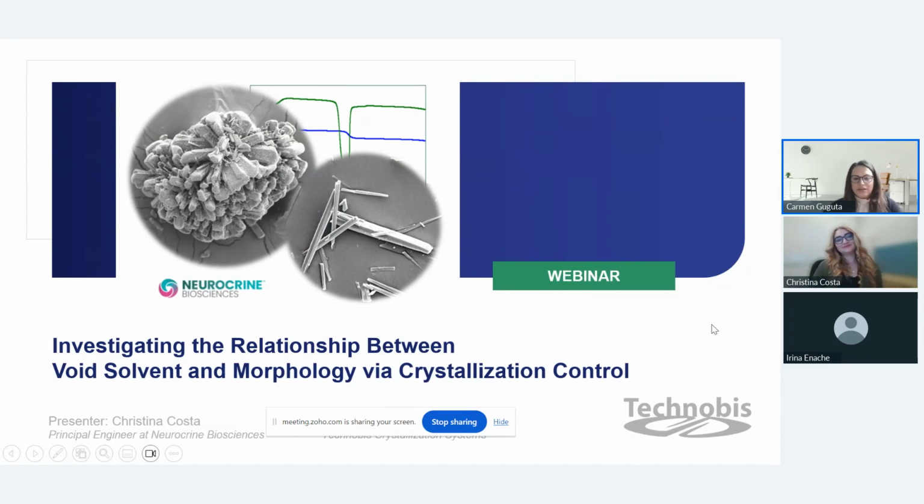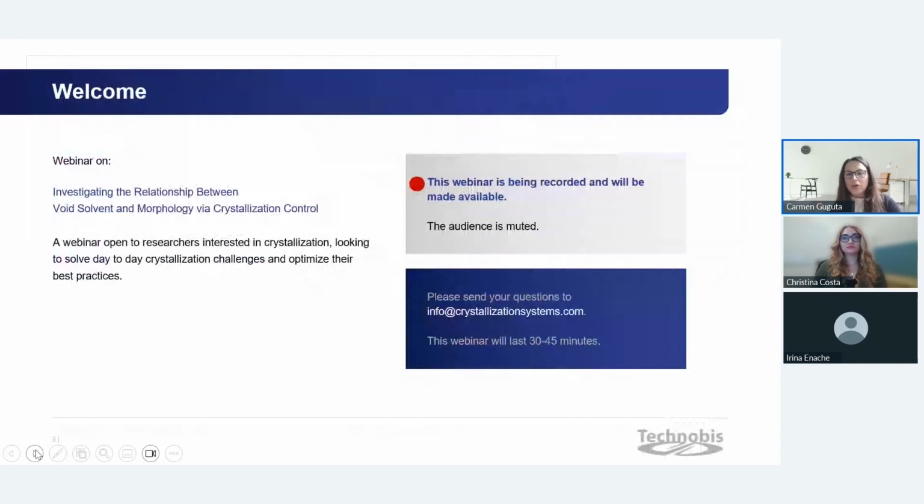So today's webinar is brought to you by Christina Costa, Principal Engineer at Neurocrine Biosciences, investigating the relationship between void solvent and morphology via crystallization control.